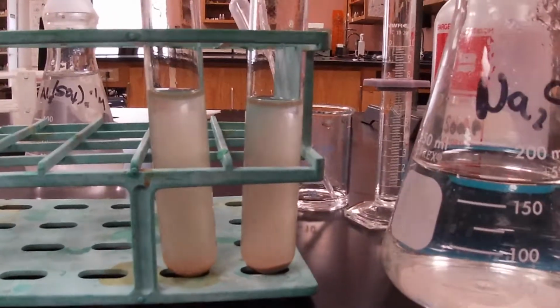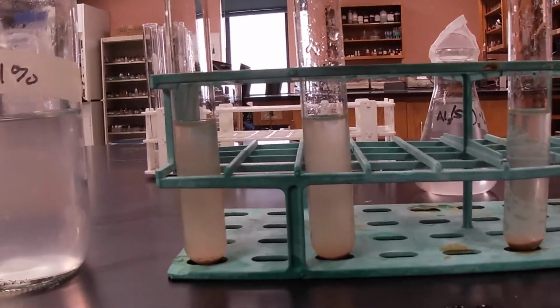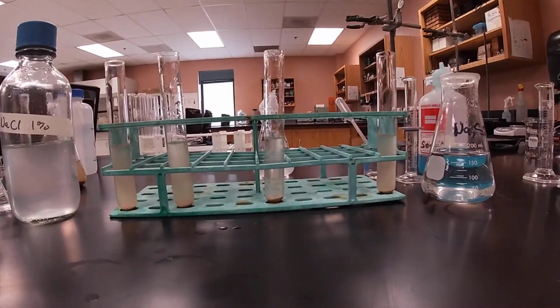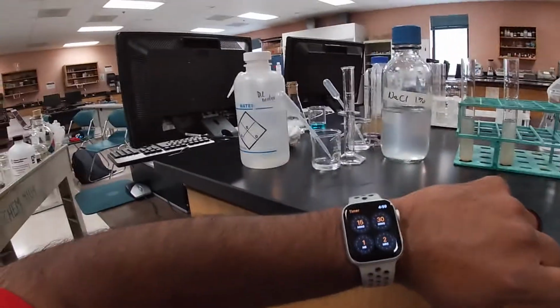So now we're gonna let it settle again for another 15 minutes, and then we'll check again. All right, so let me set another timer. Let me zoom out so you can see all three solutions. We'll set another timer, 15 minutes, and then we'll check it out.